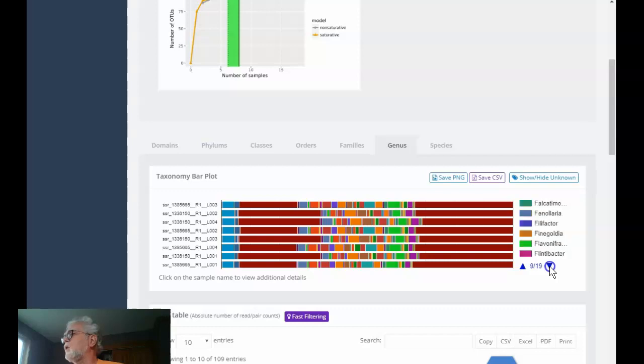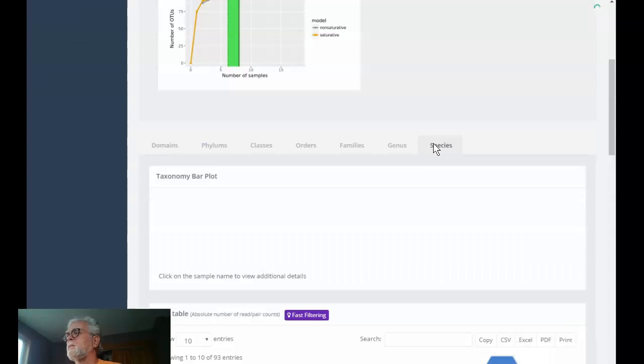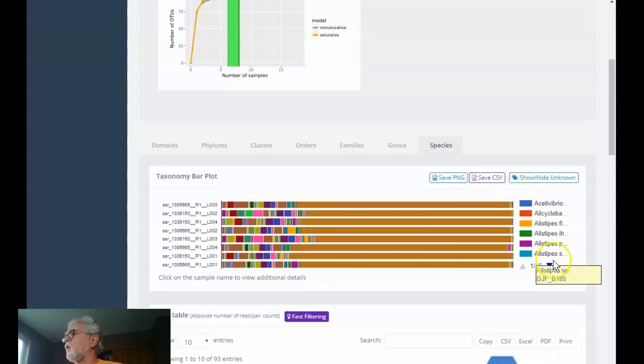And of course, our old friend E. coli is not listed there because that is a problem with the 16S, but we have a whole bunch of other things there, 19 different genus down the species level. We have a long list of species. I notice we have a whole bunch, 70%, which are unknown species. So we get to see the unknown species here.